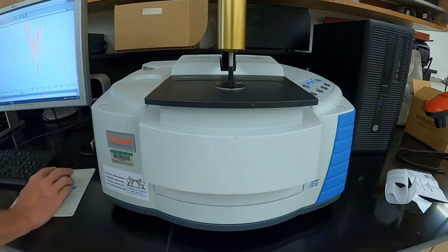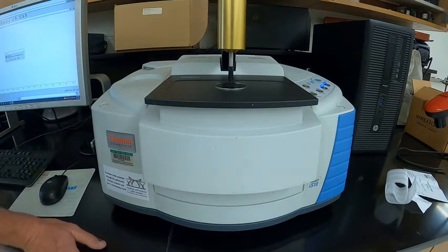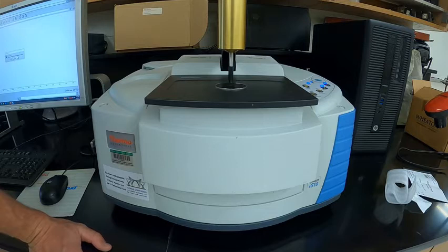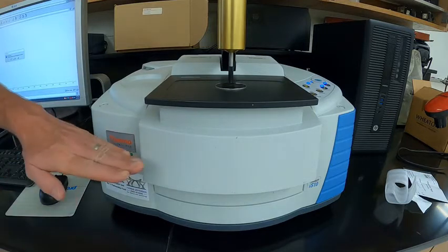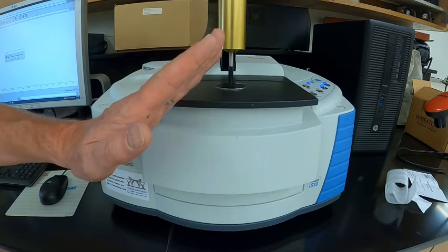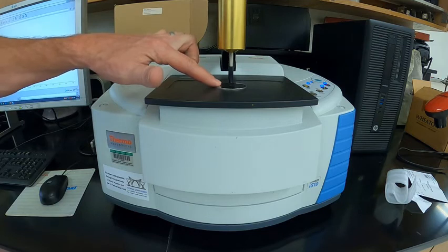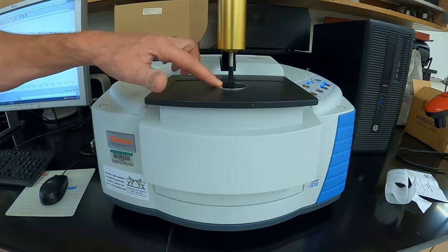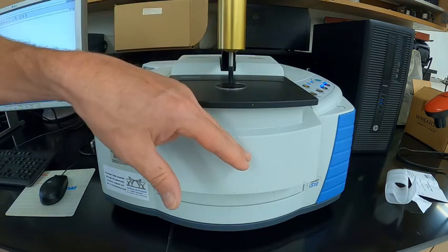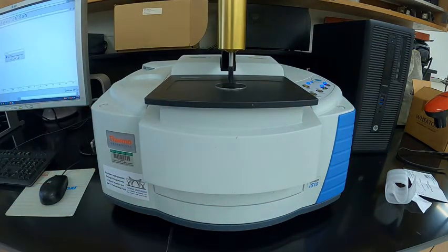So what this has, the diamond tip, it allows you to put a very small amount of sample on the tip of a diamond, and what happens is as the radiation comes through the instrument, it gets reflected up to the diamond, then the sample light reflects through the tip of the diamond and interacts with the sample over here, and then it scatters back towards the detector and goes on to the detector, and you can acquire a spectrum that way.